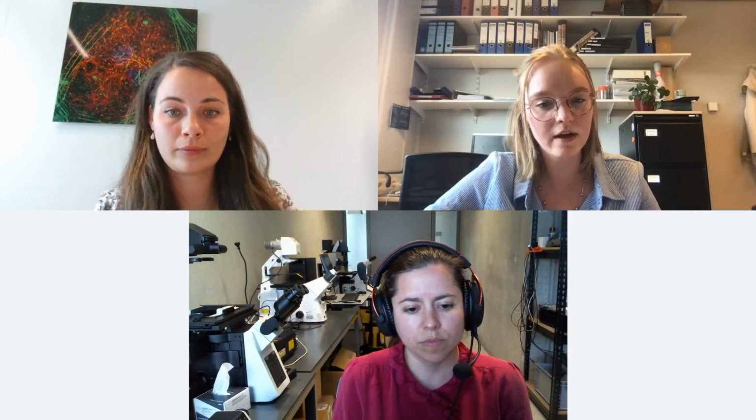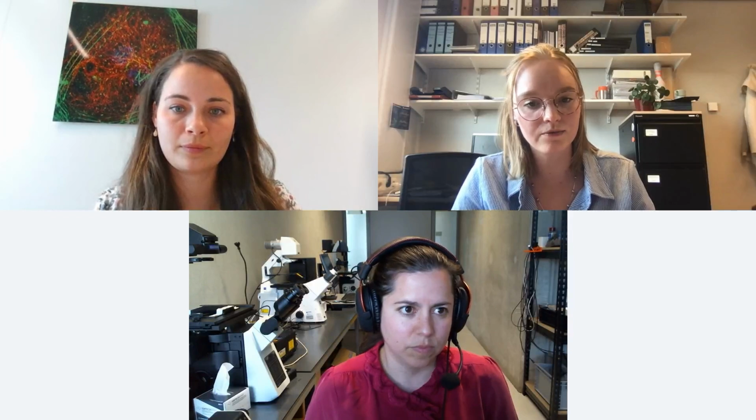So we have managed to image in a 2D setting for about 15 hours, which is already quite long because we expose the cells every 10 minutes. Well, I cannot do the math right now, but it's quite some time. For a 3D setup, this is a bit harder because, of course, the Z range that we want to capture is bigger, so that also means more exposure. But at least we now managed to get around 8 hours of footage, which is quite long. It shows some nice dynamics.